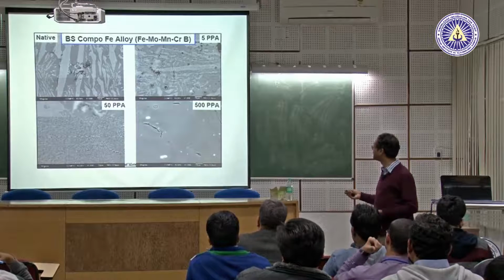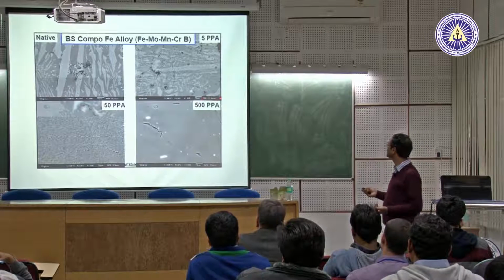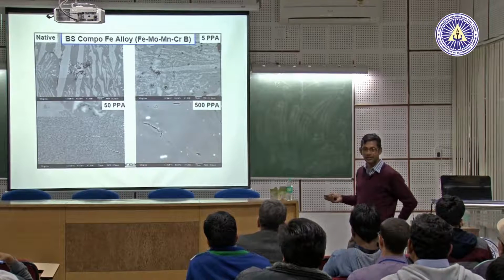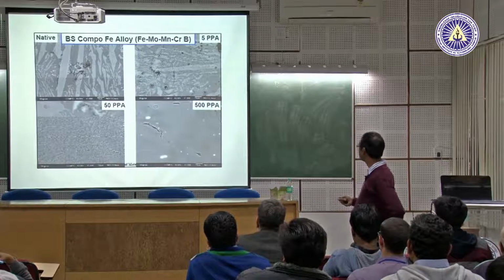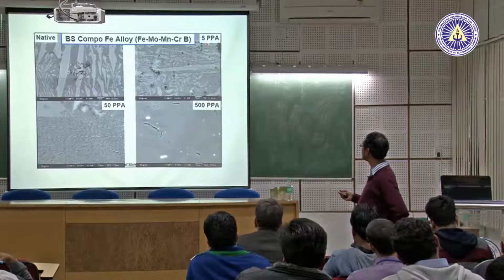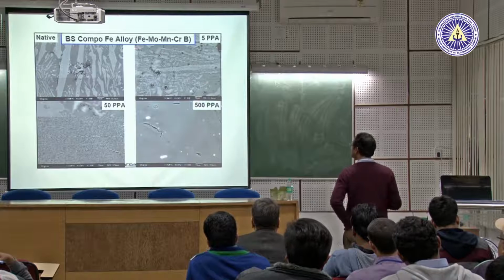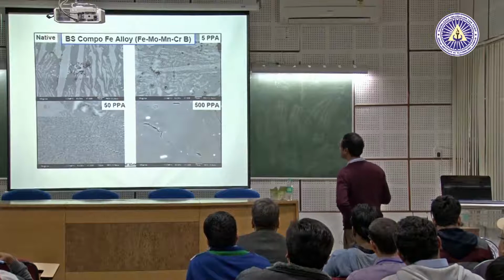So you can, by different coatings, this is a very large amount of coating layers, as you asked, no? This is very large, this is small, and this is the optimum coating actually. This is optimum coated sample.